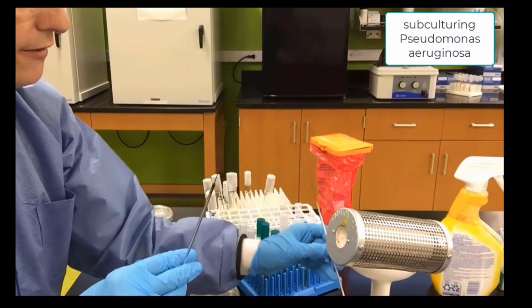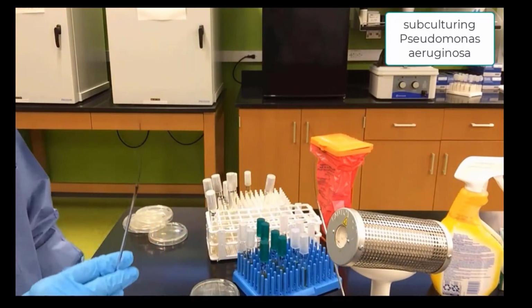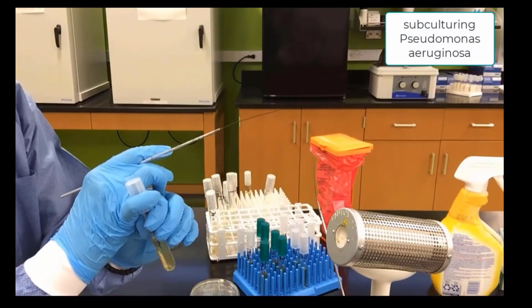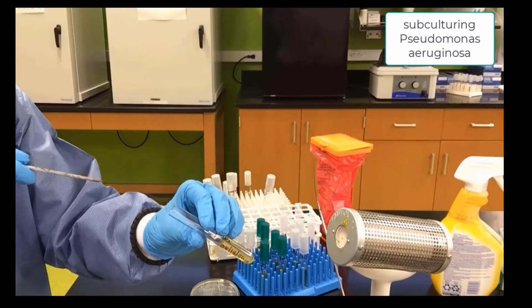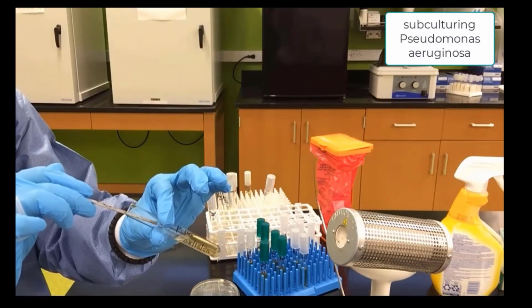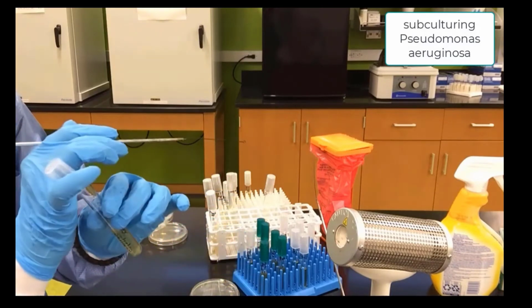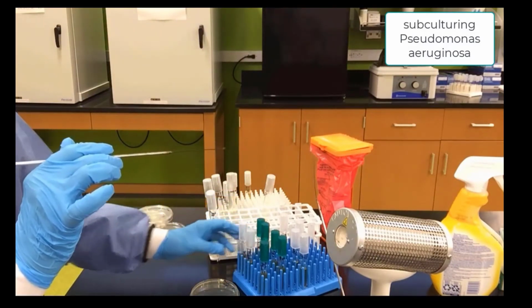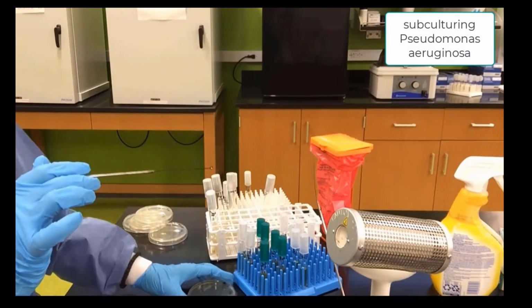Pick up another loop that's been cooled. Want to make sure those loops are cooled so you don't kill the bacteria. Use the ring finger, the little finger again. Go in, get some more Pseudomonas sample. Come out carefully, cap the tube, place it aside. And now we will pick up the plate.